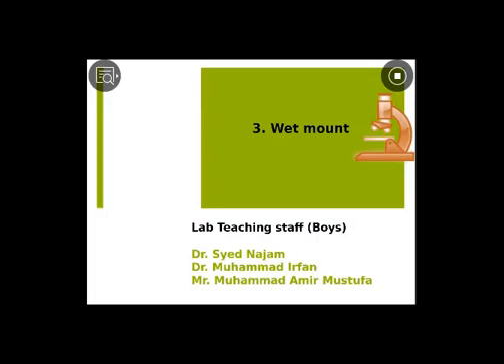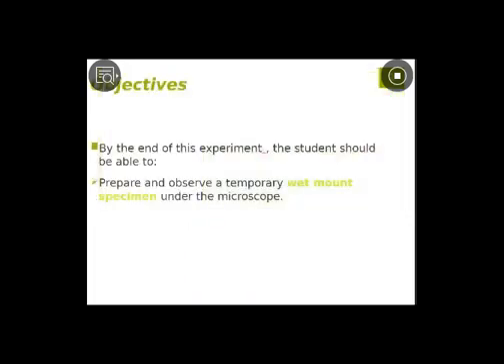Last time we discussed two experiments. One was the lab safety measures, and the other was the microscope, the parts of the microscope, and the functions of these parts. Today we are going to make a slide. Today I will tell you, and when you come to the university, inshallah ta'ala, in the lab, you will perform that experiment.